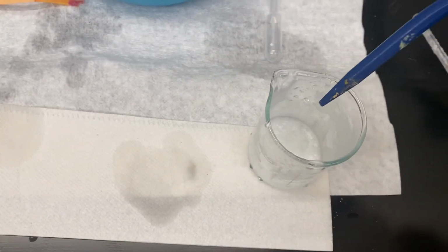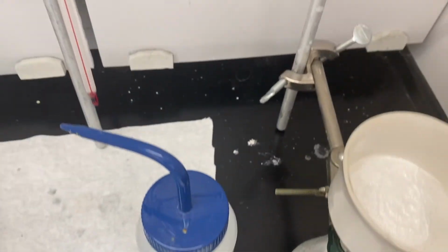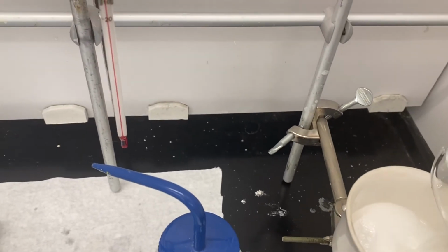To rinse out our flask. Make sure we get a nice high recovery.